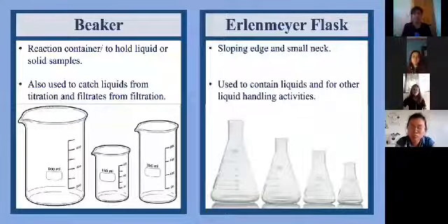Next is beaker. Beaker is used as a reaction container or to hold liquid or solid samples. They are also used to catch liquids from titrations and filtrates from filtering operations.